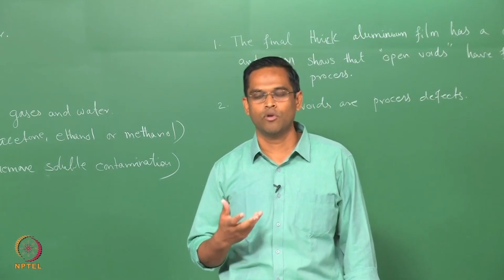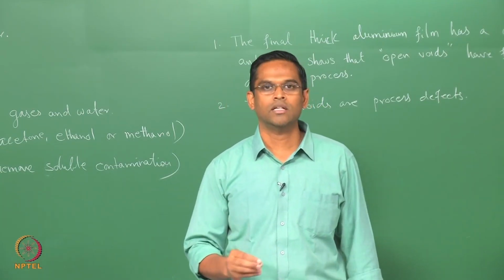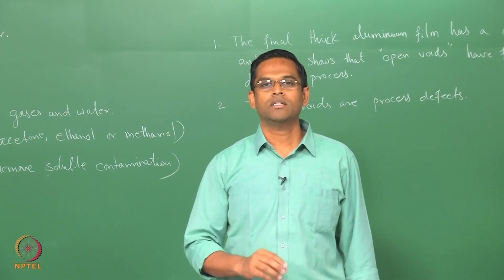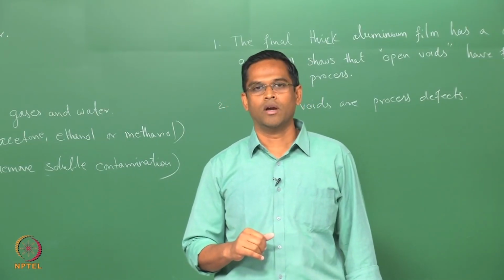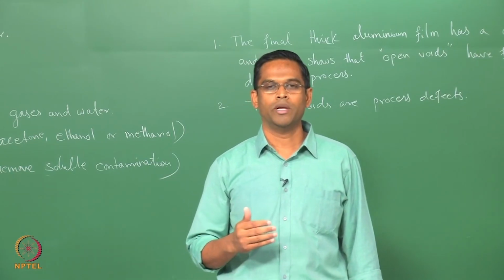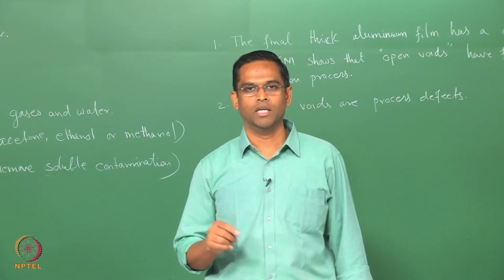So, that is first and foremost important you have to realize before you go for this analysis, whether you have the elements sufficiently present in the sample. Please refer to those slides where I have given the detection limits for EDAX, that is energy dispersive spectroscopic analysis, where I have given different case studies as well.